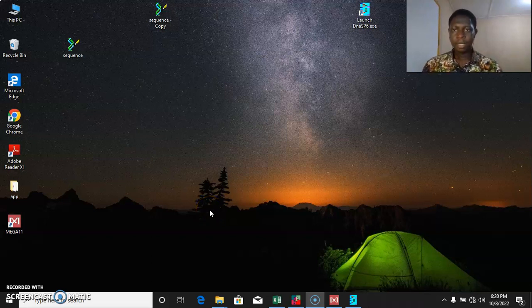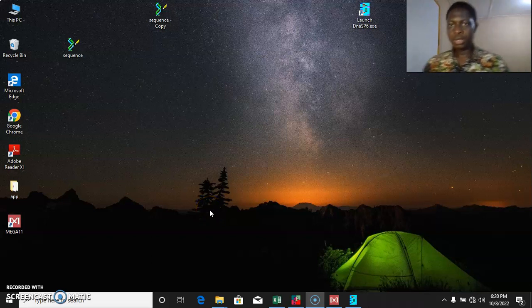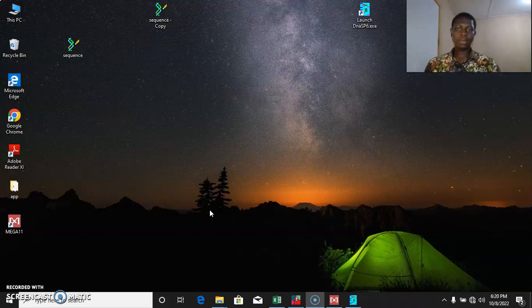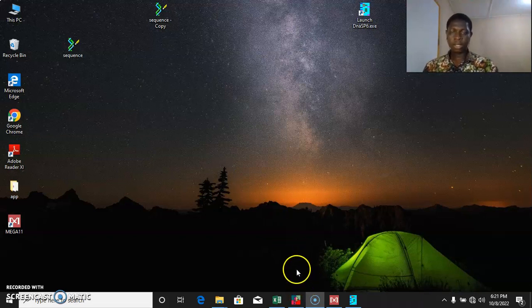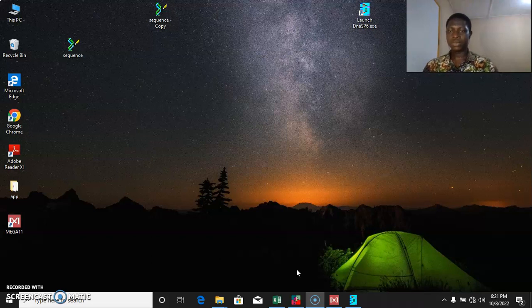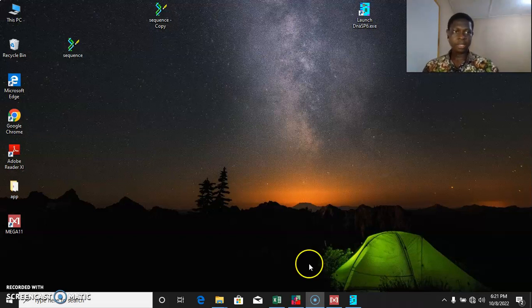Hi everyone. In today's session we are going to be talking on building a haplotype network. The main software we are going to be using is the PopArt software. All other softwares we are going to be using in this session — the link to downloading those files will be provided in the caption section.